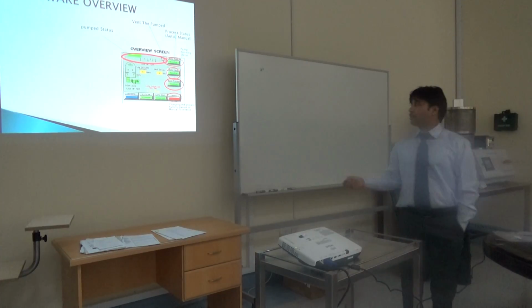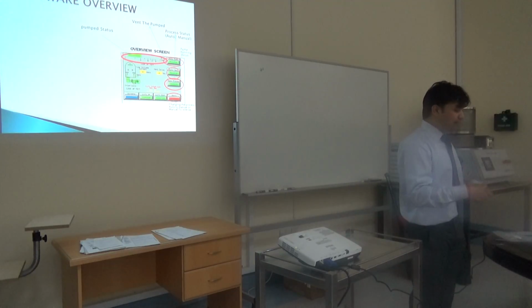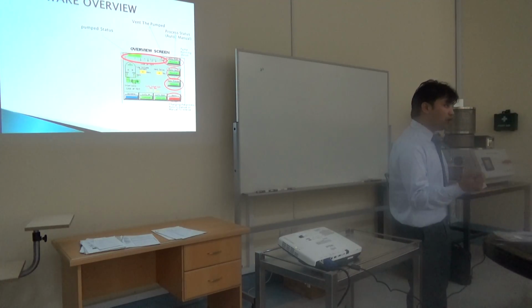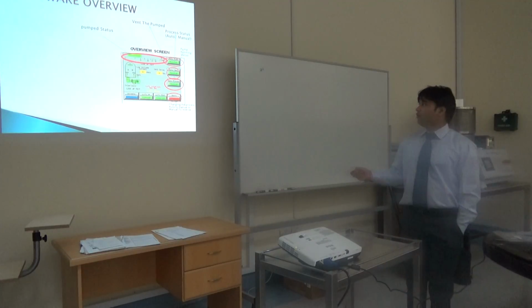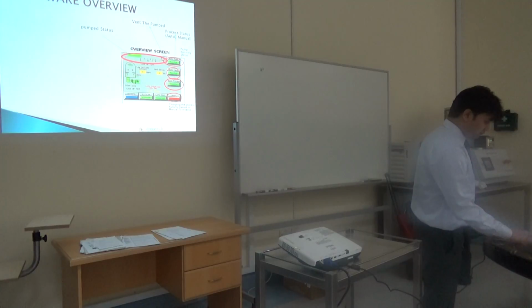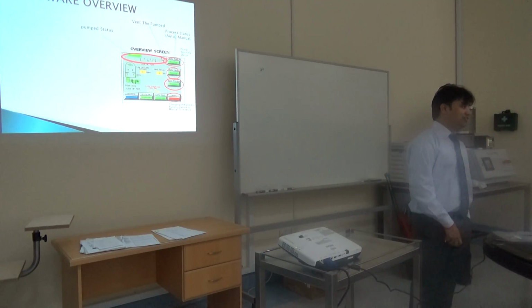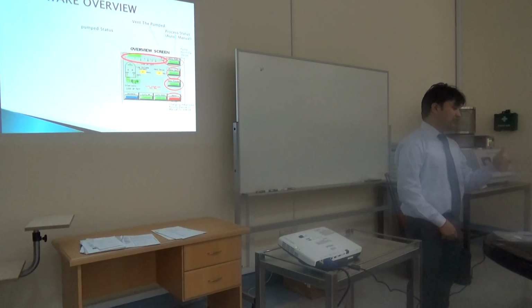Next, this is called the abort system. Suppose you want to go from automatic process to manual process, or manual to automatic. At that time we need to select this abort process. So this is an interactive screen. You can touch it and make the changes. We'll discuss in the next slide.